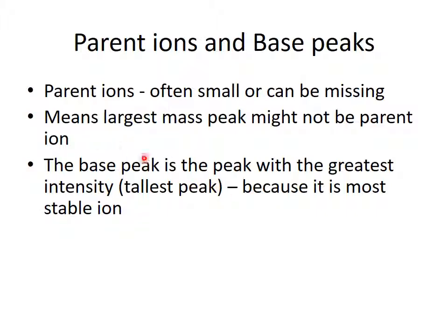The base peak is different from the molecular ion. This is always the peak with the greatest intensity, the tallest peak. And this is usually because it's the most stable ion.